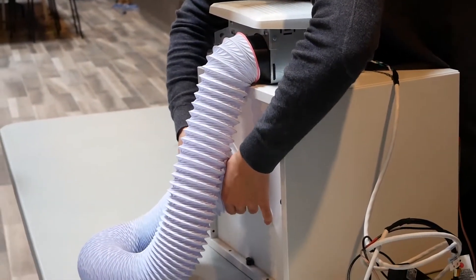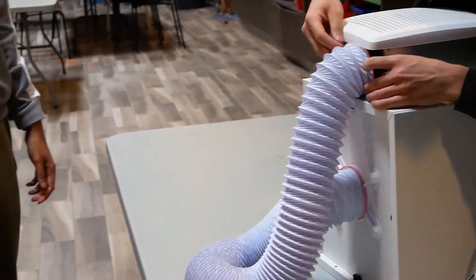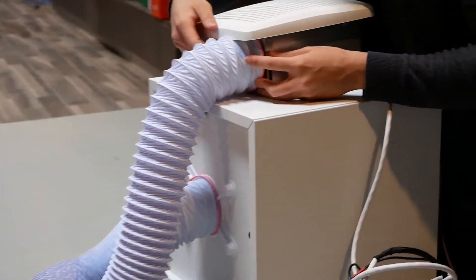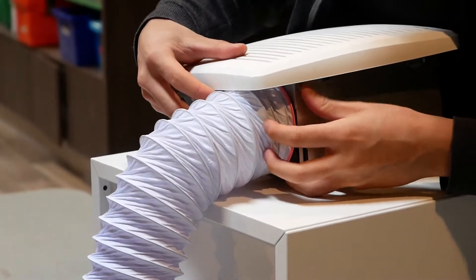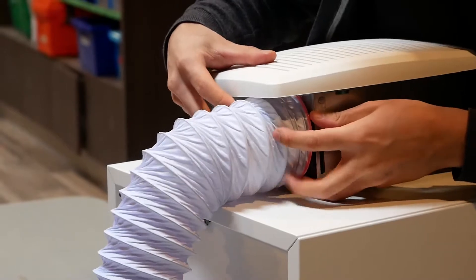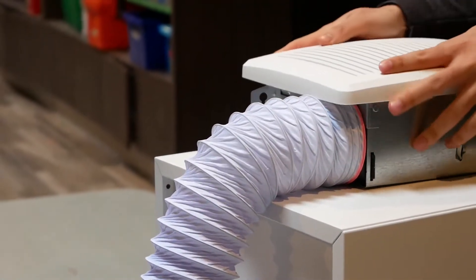Typically when people are doing tissue culture, it's in an aseptic environment, which means everything is sterilized. At the STEAM project right now, because this is a developing project, we don't exactly have the space that we need to create an aseptic lab.